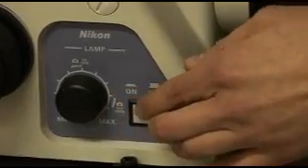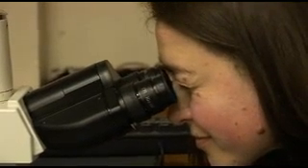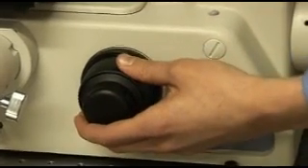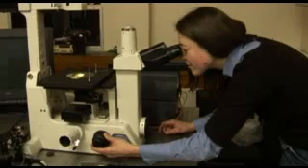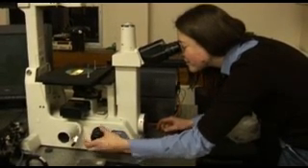For us, the main challenge was to figure out how to measure the viscosity on a single-cell level, because on such a small scale, conventional mechanical methods are not going to work. So our approach to deal with this was to use small fluorescent molecules called molecular rotors, in which fluorescence, emission of light, competes with intramolecular rotation, when one part of the molecule rotates versus the other. And in a viscous environment, this rotation is going to be slowed down, so the competing channel, fluorescence, can be very dramatically affected.